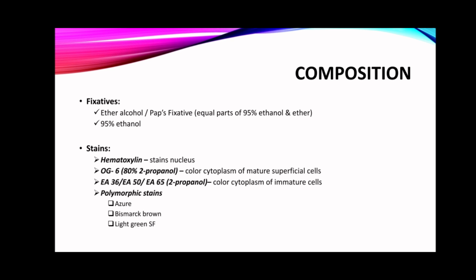But the reason why it is not commonly used nowadays, class, is because of its volatile character. The PAPS fixative, class, is made up of equal parts of 95% ethanol and ether.